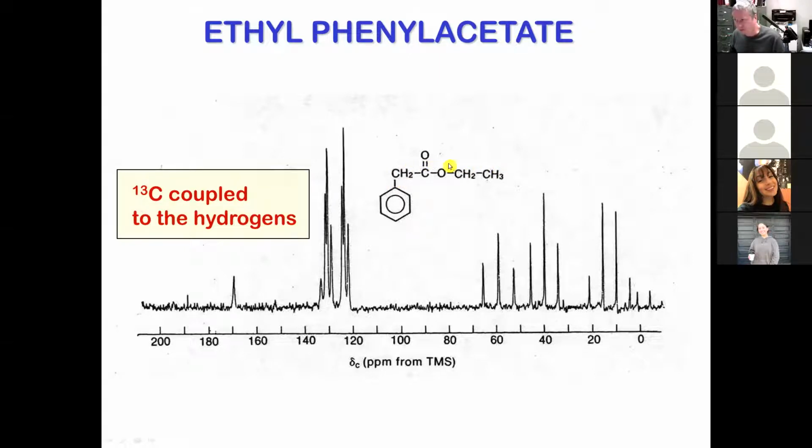The problem is if I have a more complicated molecule, all of those are going to be overlapped, and it's going to be a big crazy forest. So this happens to show them distinct. But I can get rid of the couplings, and I'll show you how we do that. Then you basically just get singlets. That's actually more useful because everybody does that for carbon NMR.